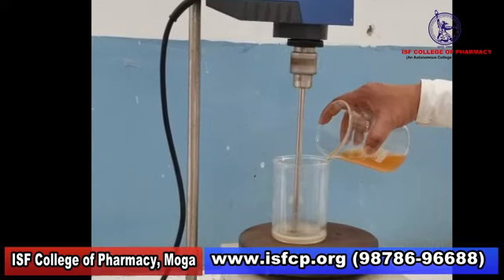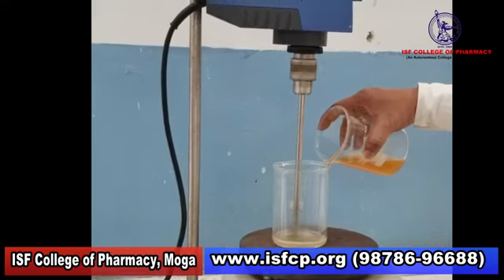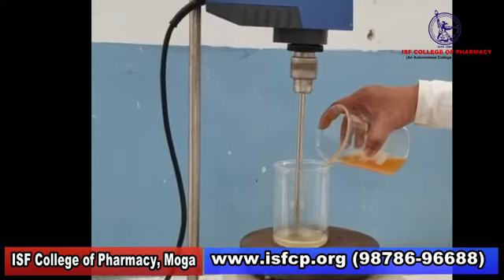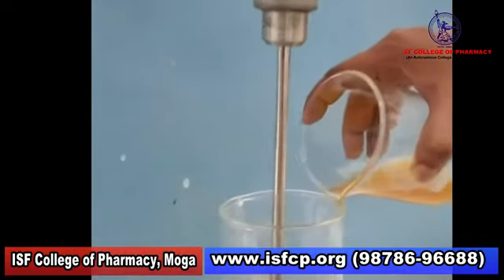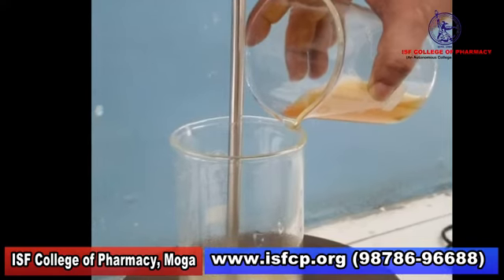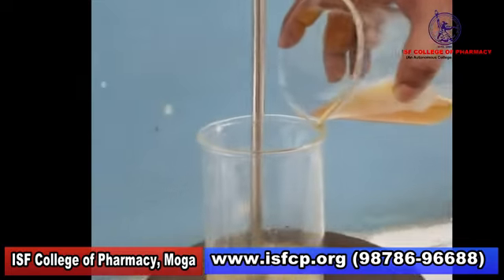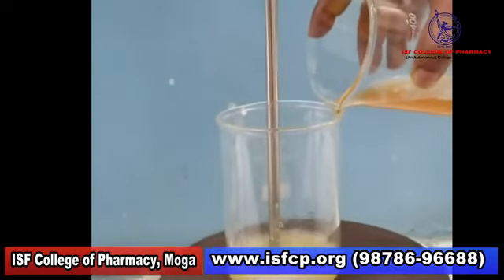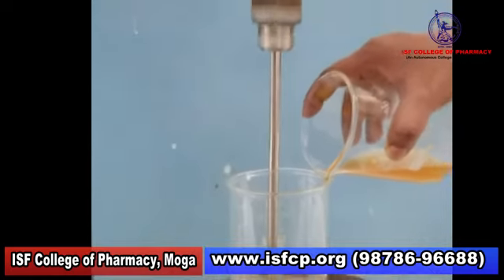You can see the emulsification starts. It will take 3 to 5 minutes. We are adding the aqueous phase very slowly to the oily phase. The revolution of the mechanical stirrer is kept between 300 to 350 RPM, and the stirring will continue for 45 minutes.